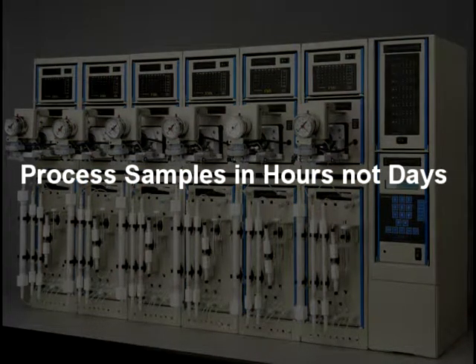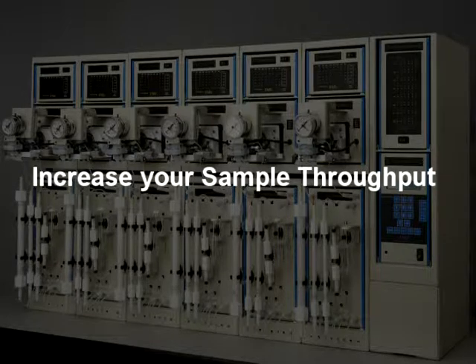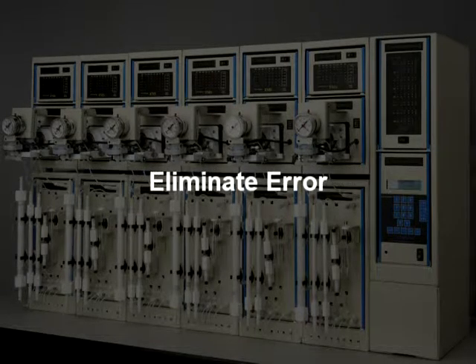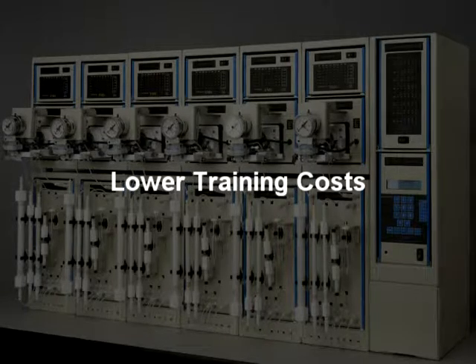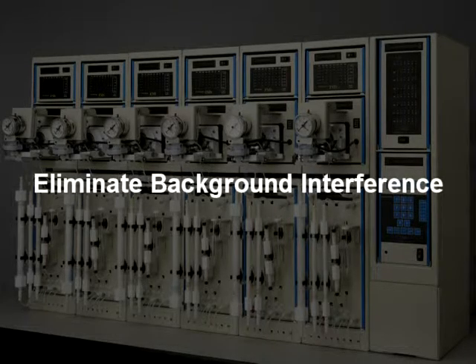With a few keystrokes, the PowerPrep system performs an entire column chromatography, automatically achieving consistent and high recoveries for all analytes. The unattended operation of the system saves labor and valuable time. The PowerPrep system reduces the amount of glassware and solvents required for manual sample cleanup.